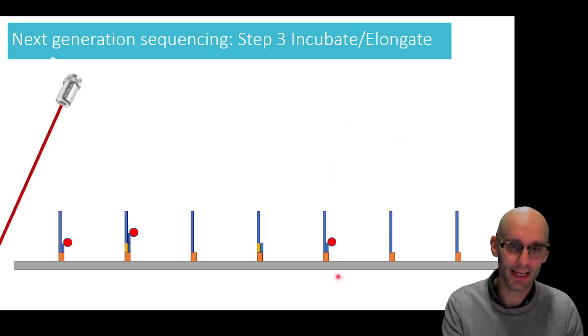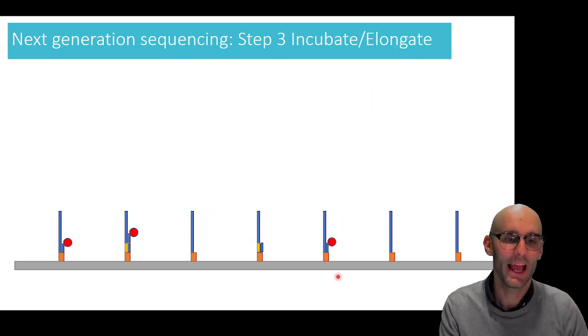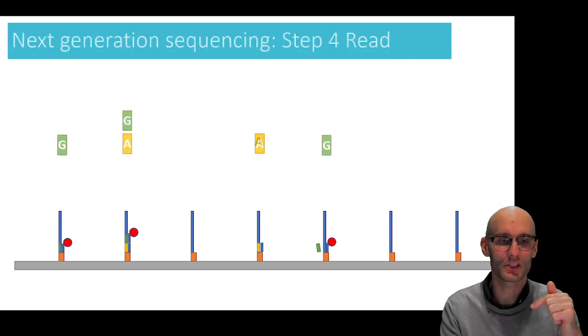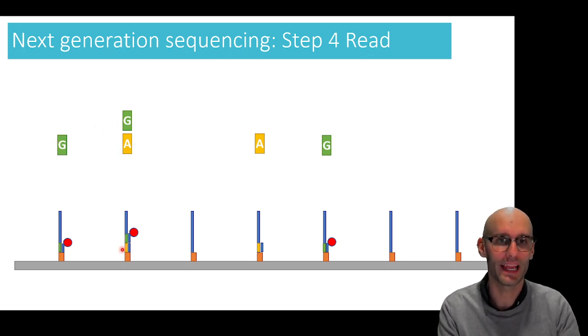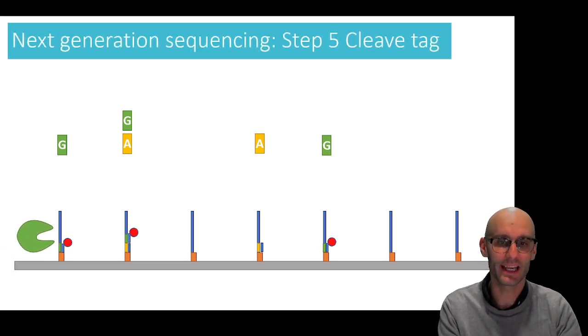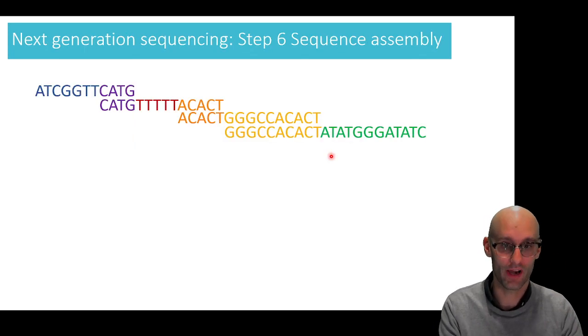And now we're going to run our laser across and see where we get the bings. We get bing, bing, bing, right? And so now we can record that those fragments there had an attached cytosine, which means they must have the corresponding guanine there. So we've got the G there, and we know that this goes A and then G because we recorded the A at this location first, and now we're recording a G there, and we've got an A there and G there. And hopefully what you can see is by doing this over and over again, you can slowly, eventually, sequence all your fragments.